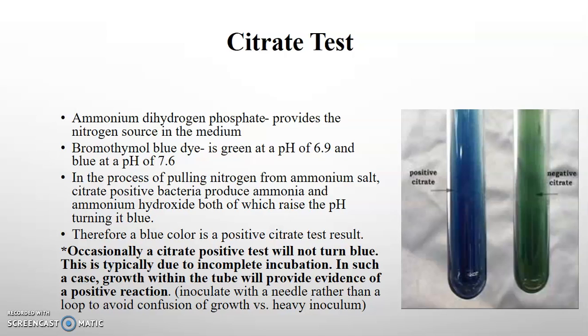So if it's green and there's no growth, that's definitely a hard negative. But if you look at it and it's green and there's growth, that's still considered positive. We would ideally like it to be blue, but sometimes that doesn't always happen. And typically we do inoculate these with inoculating needles just to get a small amount of bacteria on there, because if you get too much, you might incorrectly read the results as having growth when really you just added a big clump of bacteria. But predominantly for your purposes, with the procedures that we're doing and the results that we're reading, you'll be able to just look at the color and record results.